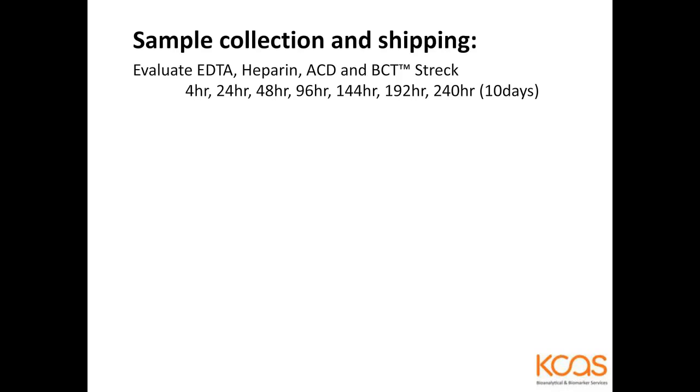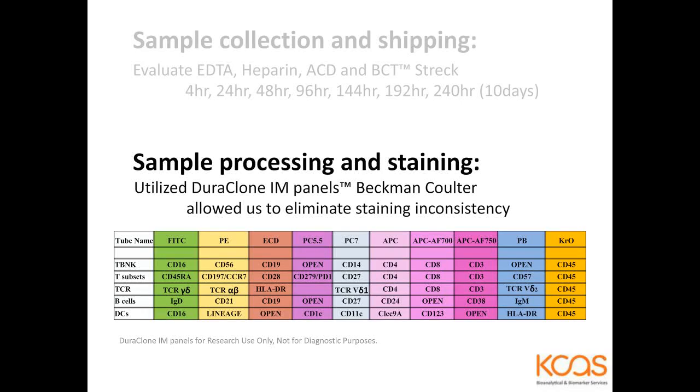That will offer up to 10-day stability on these biomarkers. All right, no one panel will fit everyone's needs. So we have 5 different panels that we initiated. These are the Duraclone immune monitoring panels available from Beckman Coulter.